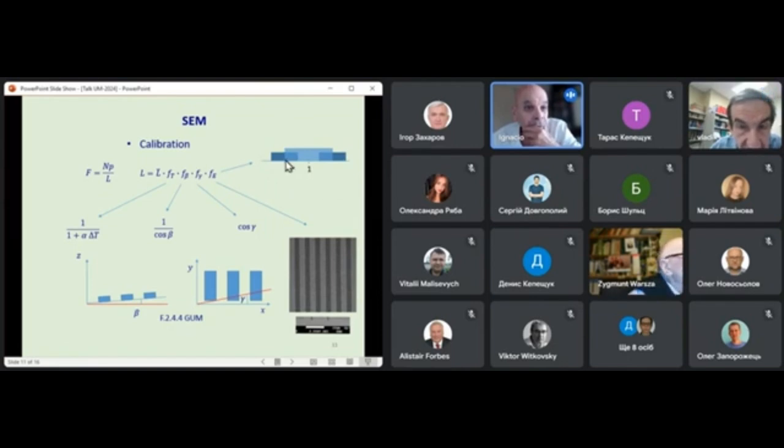Yes, this is the uncertainty in measuring the borders. So you assume it's a uniform distribution, right? Based on what you were drawing. Yes, two uniform distributions. Right, because this is just an assumption. The question is, will the results change if you have some other distribution here, like a normal cutoff or something?